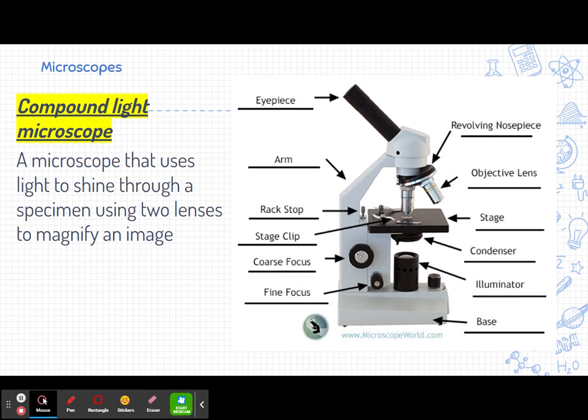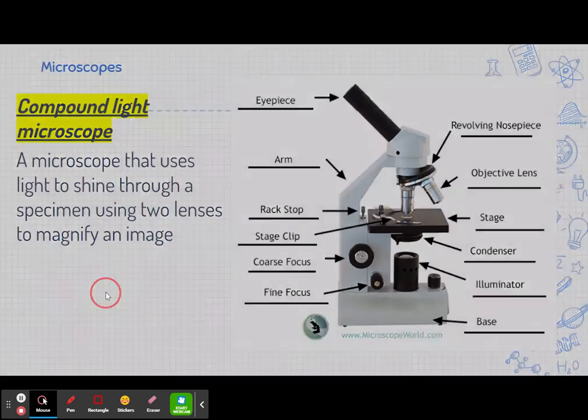The next microscopes we're going to look at, they might be alive when they're put under, but they're not alive when they're done. When we start looking at microscopic critters in pond water, we're going to put the pond water back because those critters are alive. And that's why you probably want to wash your hands, and probably not eat or drink any of that.